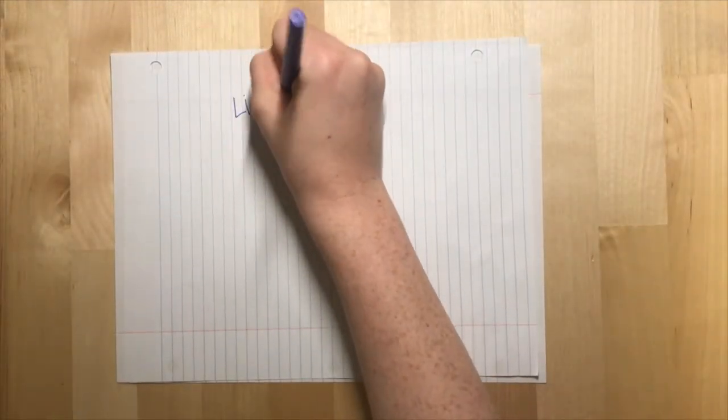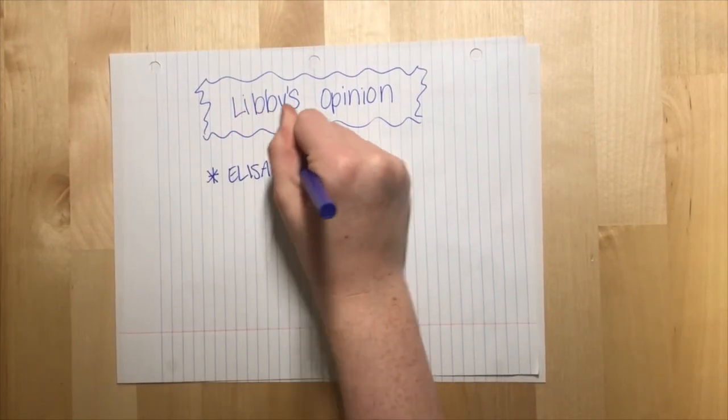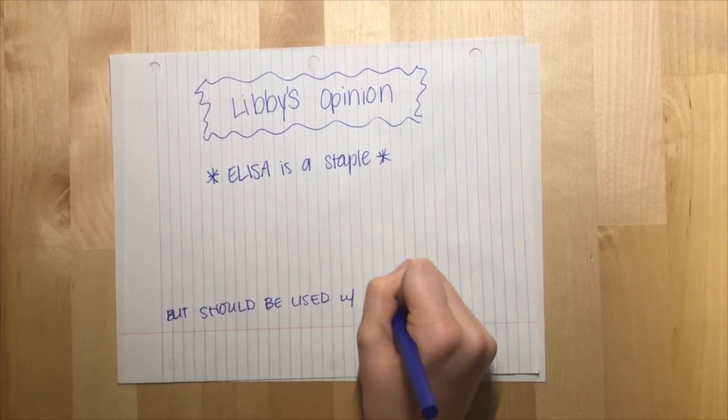So what's my opinion? I think that ELISAs are a staple. However, because there's much room for error, it should be used in tandem with other bioanalytical techniques.